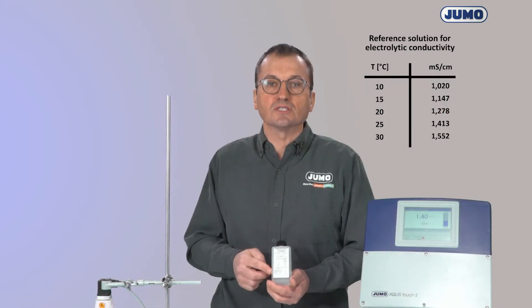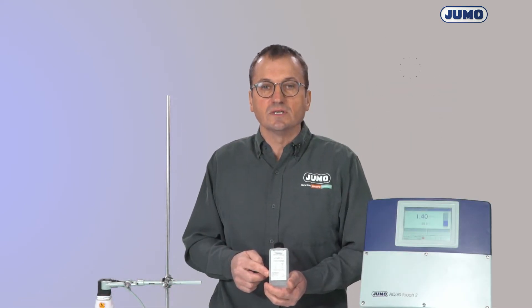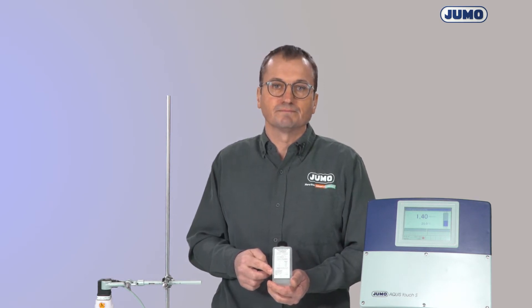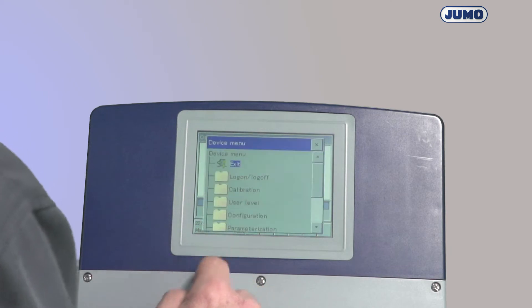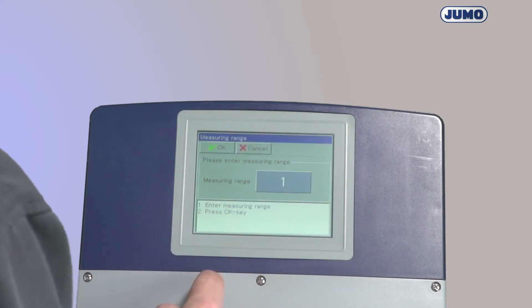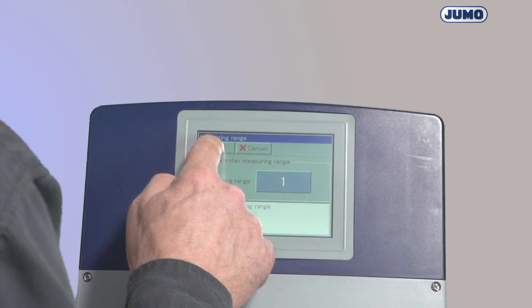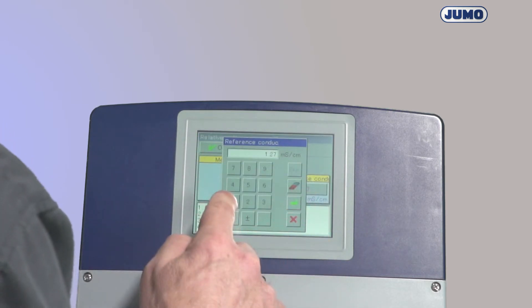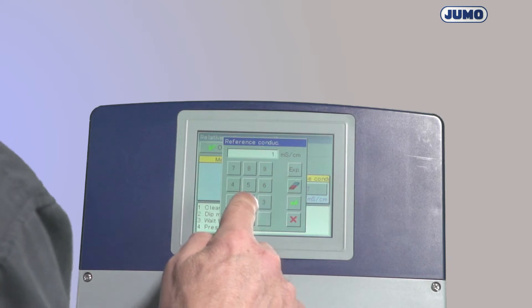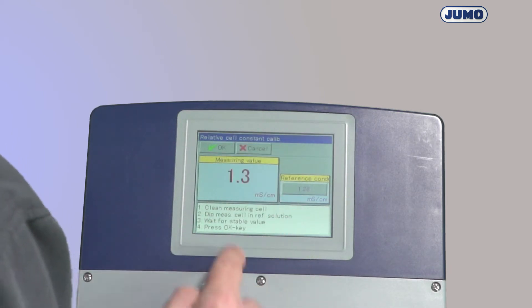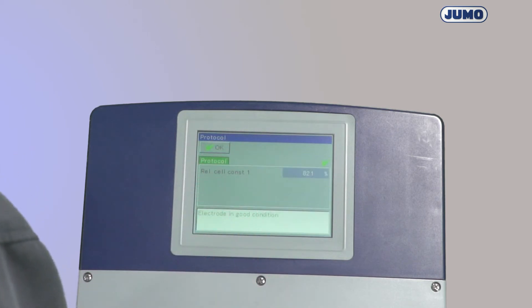For temperatures between the indicated values, it is practical to interpolate linearly. At the transmitter, I start the calibration routine for the relative cell constant and enter the known conductivity of the test solution. The determined relative cell constant is displayed here.